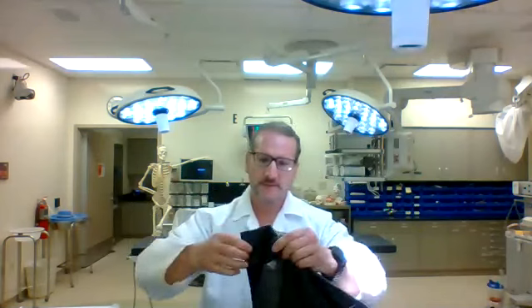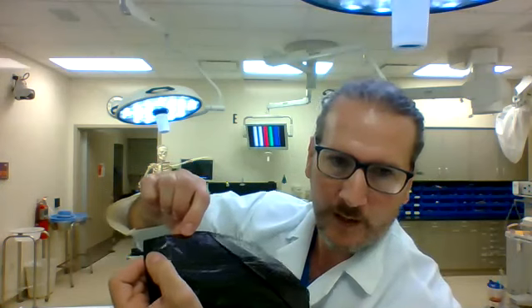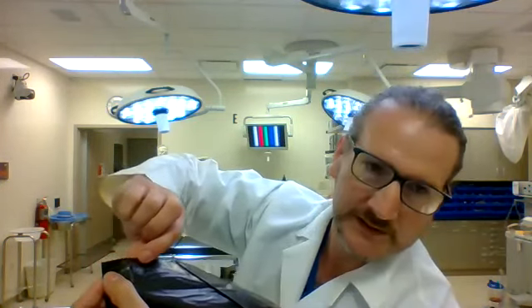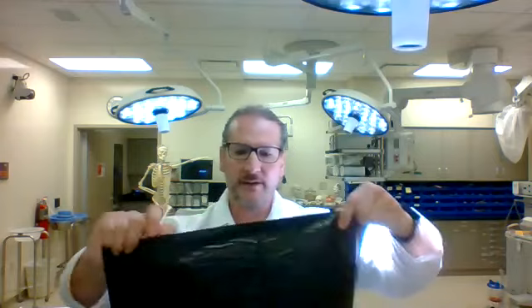Surgical lights, right. Don't open this completely up. You're going to open it just a little bit until you find the end that has the seam. So if this were a trash bag you're putting in your trash, you've got the seam right there. I don't know how well you can see it, but there's the end of the bag and there's a little, almost like, looks stitched going along. That's the end that doesn't open. That's the end you want to grab. Don't open the bag like you're putting it in a garbage can. You're going to open it flat.